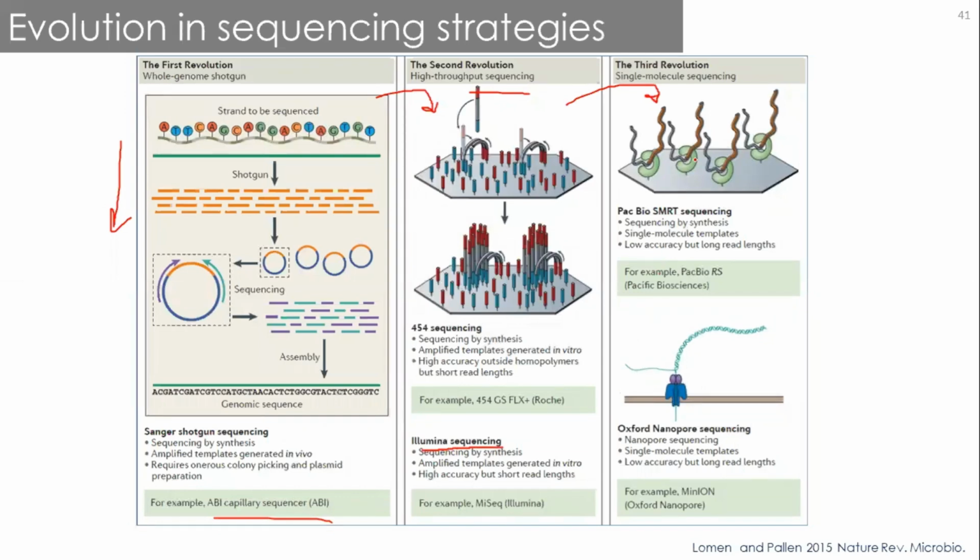Slowly we are moving to the third generation, where we have PacBio. PacBio produces a lot of genes at the same time, sequencing the whole genome and producing bigger fragments of the genes. So it is a little bit easy to actually sequence the whole genome. However, it is a very costly approach. There is another one which we are also using, that is Oxford Nanopore sequencing. It is a very cheap method because the whole machine set will come to close to 10 to 15 lakhs, and it also produces bigger fragments of the genes.